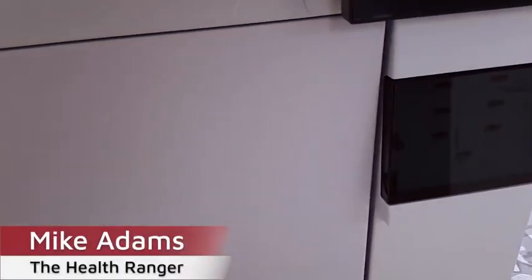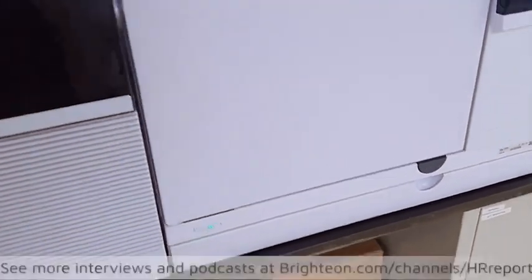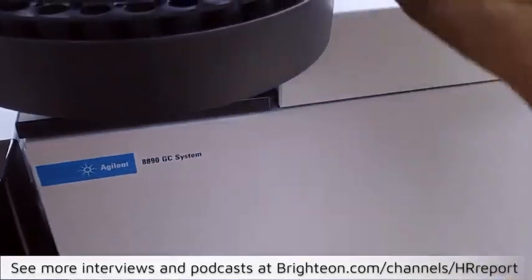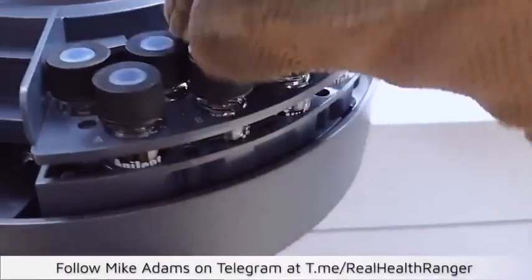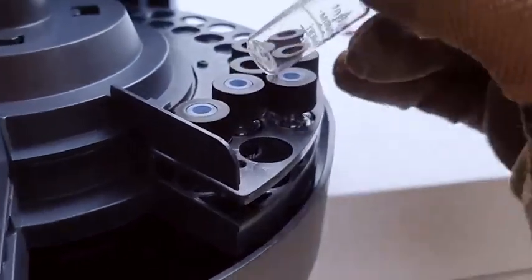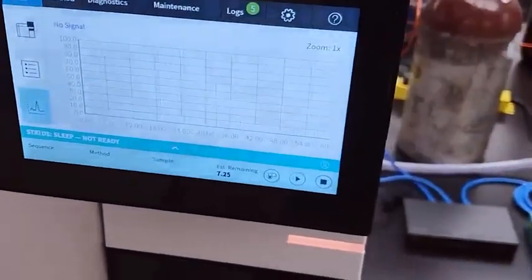Mike Adams here with the dioxin testing equipment at our lab, CWC Labs. We just got this installed — this is the auto sampler. These are some of the liquid samples that will go into the system. Nothing in there at the moment, but this is the auto sampler. This is the system — here's the main control screen. This is a GC system, gas chromatography.